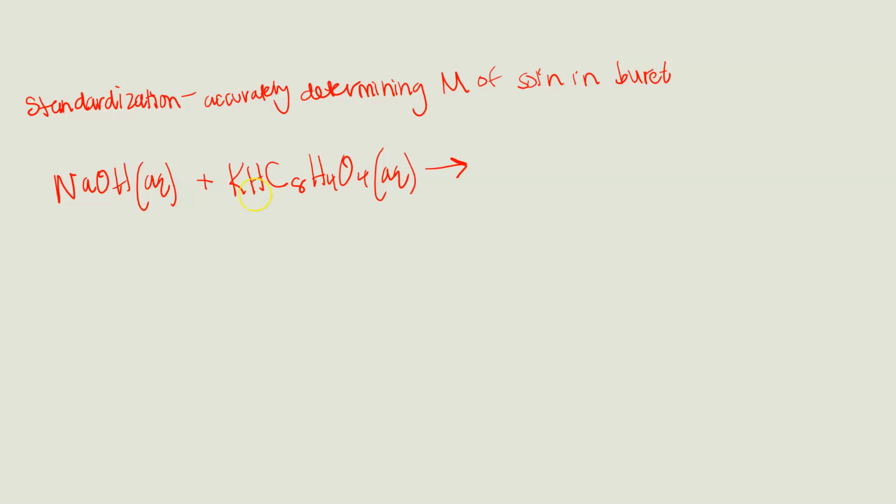So when this happens, the hydrogen from the KHP is donated to the hydroxide, which becomes HOH, which is H2O. And then the sodium is picked up by the potassium and the phthalate polyatomic ion. So we're going to abbreviate, and the procedure calls it KHP. P is the first letter of the name of this polyatomic ion, phthalate. I know it sounds like a T, but PH is. Okay, so that's the abbreviation for that.